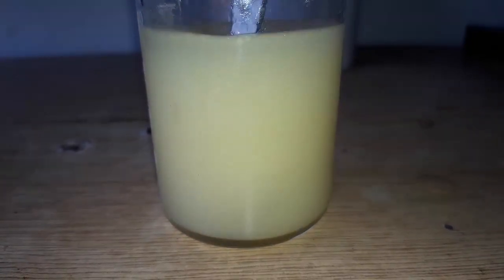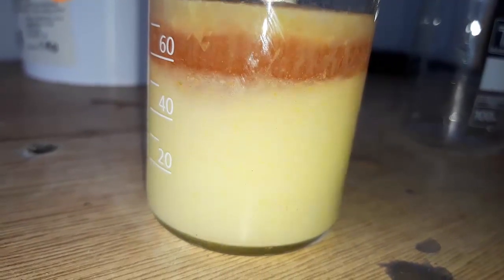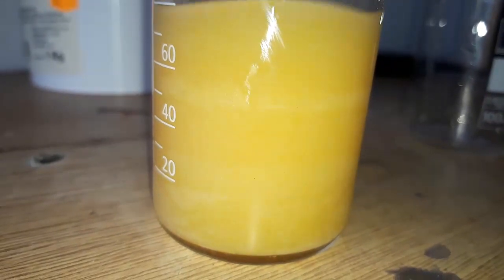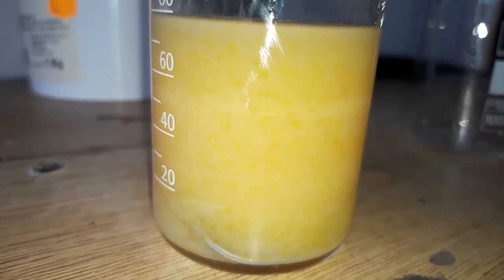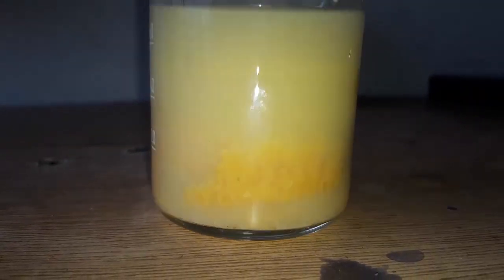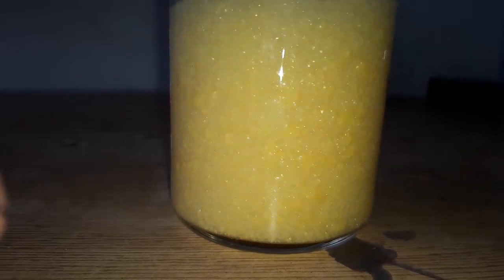Stir everything up. After 5 minutes the color change is even more apparent. Stir it again. After 10 minutes we got a solid chunk of our product. Mix again and wait 5 more minutes. After 15 minutes we have a thick slurry of dibenzalacetone.